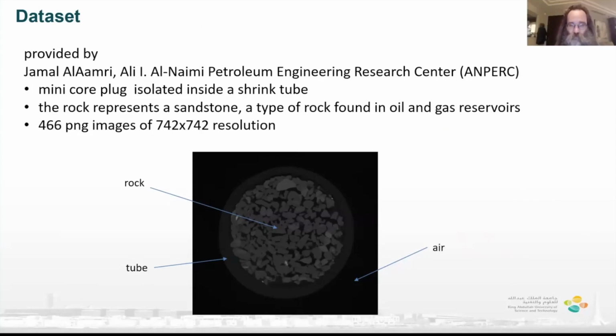If you look at it, again, you have the range of all kinds of gray values. But essentially, you see these three objects, actually two objects surrounded by air. You clearly see the tube around the rock. And that's what we're going to try to segment, to find in the volume. We start by taking a look at the volume using the techniques we have done before, try to understand better also in 3D what's going on, and start with some simple thresholding to do some segmentation.